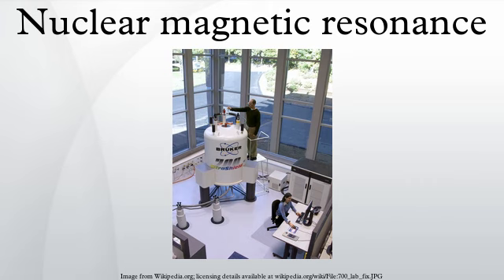Fourier transform of the free induction decay, the time is inversely related to the width of the NMR signal in frequency units. Thus, a nucleus with a long T2 relaxation time gives rise to a very sharp NMR peak in the FT-NMR spectrum for a very homogeneous static magnetic field, whereas nuclei with shorter T2 values give rise to broad FT-NMR peaks even when the magnet is shimmed well.